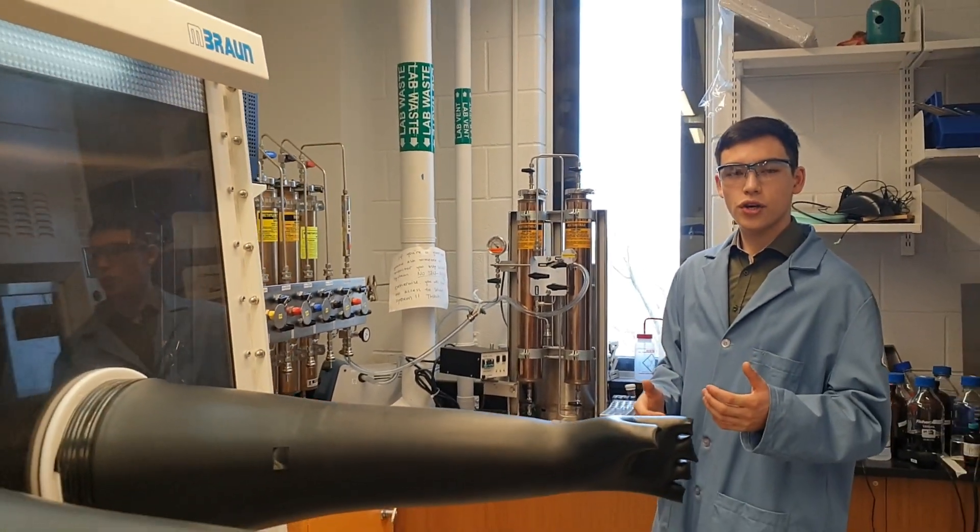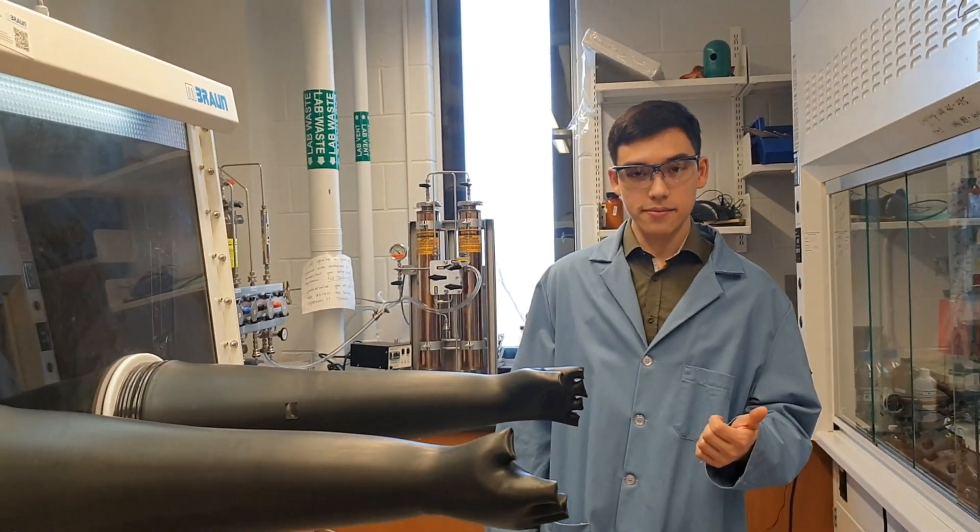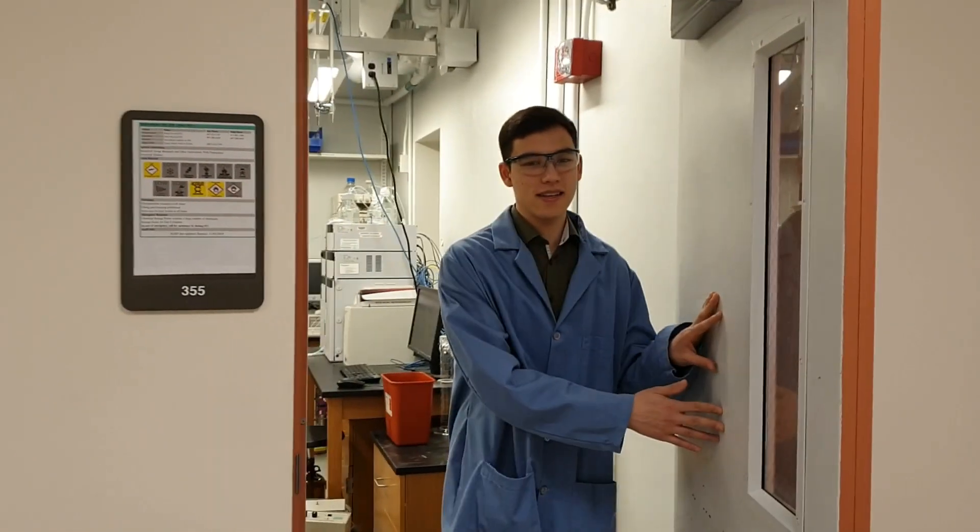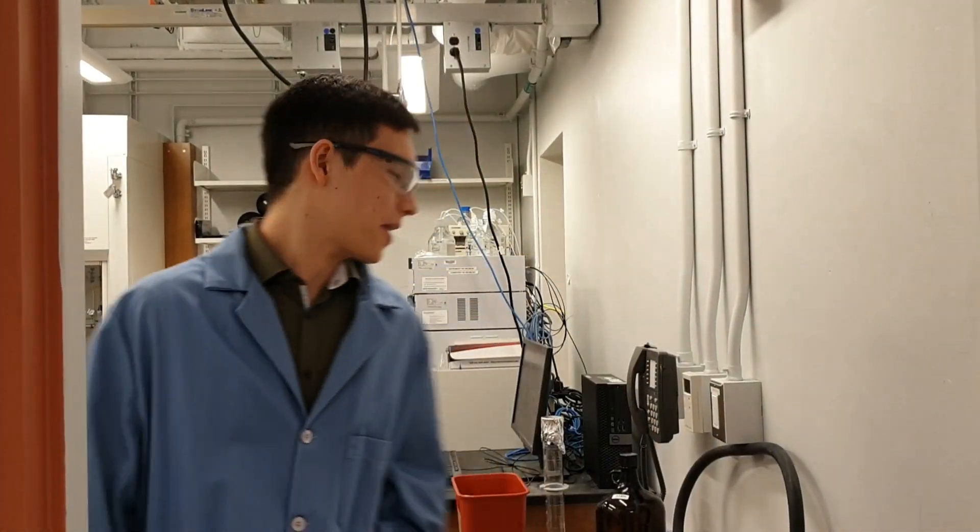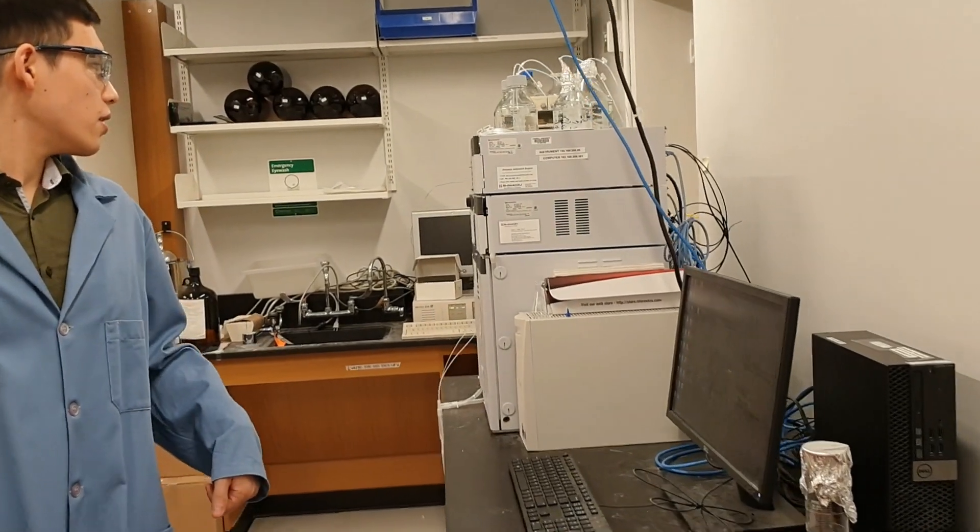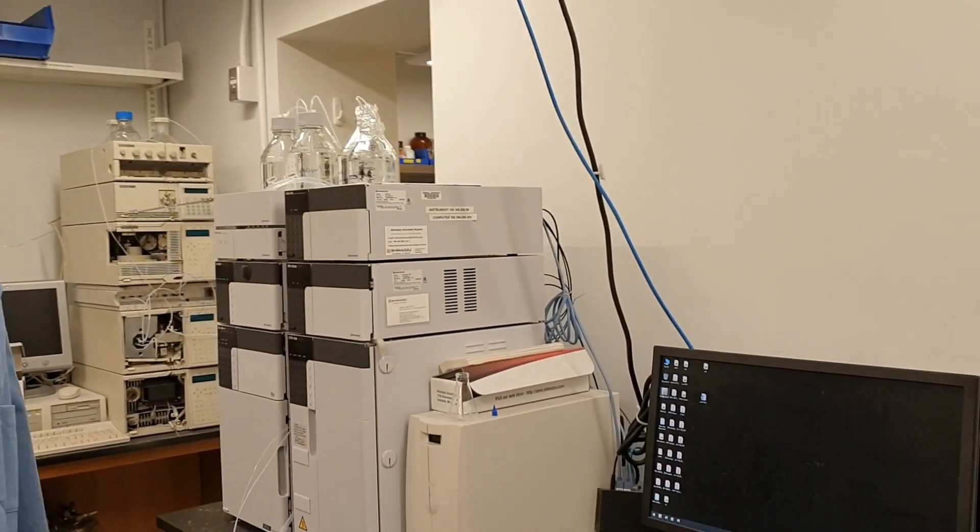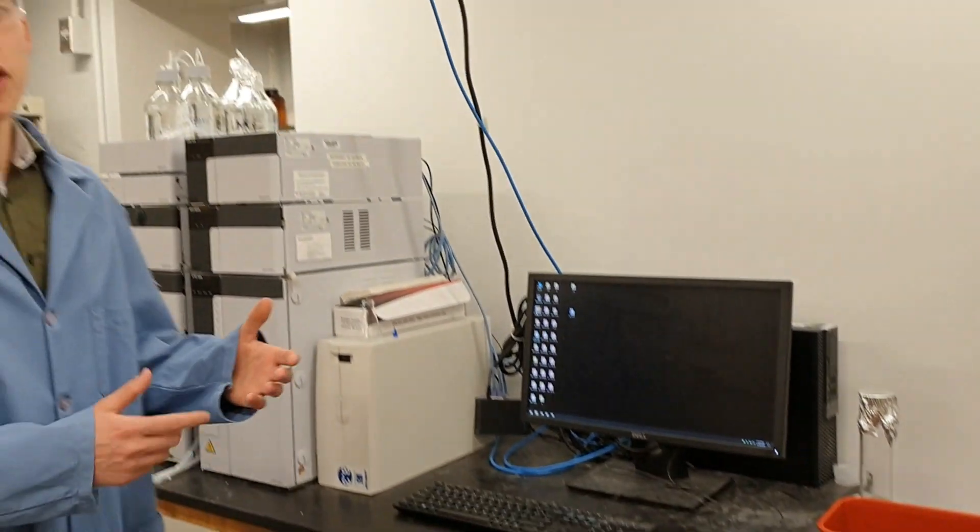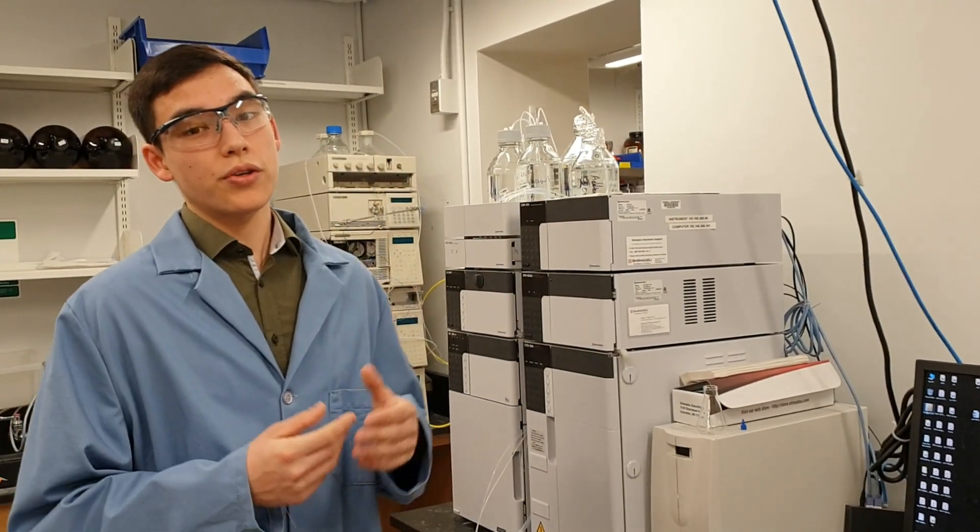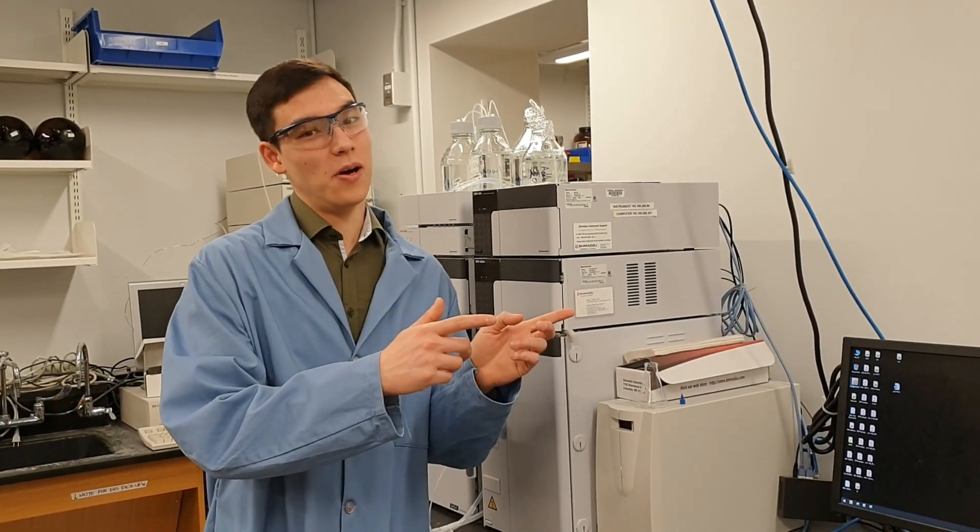The next room I want to show you is our room with our HPLCs, and hopefully soon, a UHPLC-MS. Come in. Here you see our chiral HPLC from Shimadzu. It runs with hexane and isopropanol, but you can also set up gradients using acetonitrile water, and basically customize and screen columns according to your own needs. We also have a UHPLC-MS coming in soon, so once you will be here, the MS will also be here.